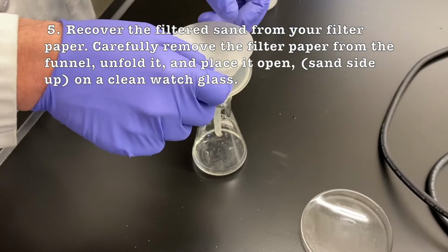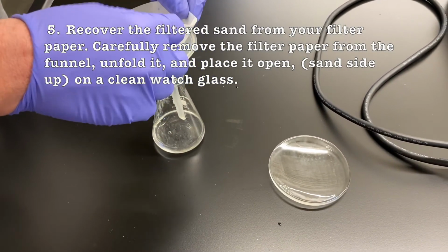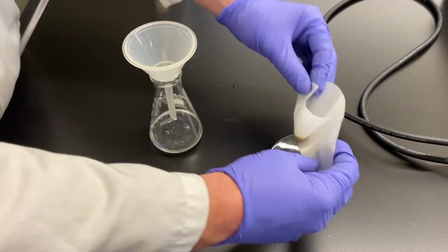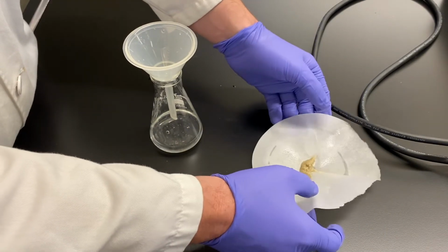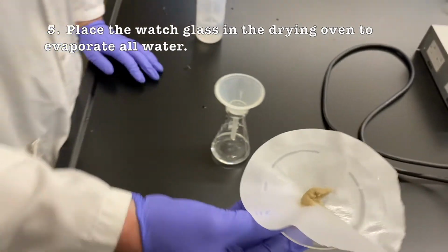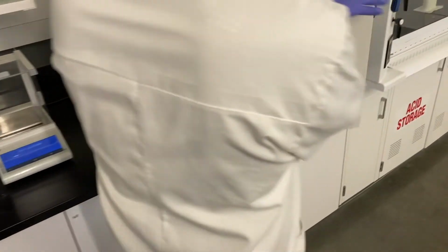And just a reminder, we weighed this piece of filter paper before. And so now it just has sand on it. So if you know the mass of the filter paper and the mass of the filter paper plus the sand, you can subtract those two to just get the mass of the sand. But before we go mass it, we actually need to put it in the oven to remove all the water.